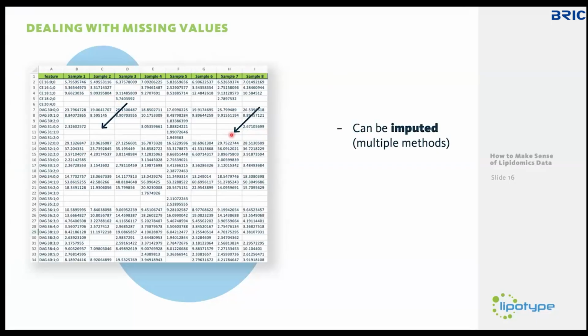One approach is that you can impute them. And there are multiple algorithms. We recently did a little paper testing most of the algorithms that came to our mind, and we found that one and two actually work very well for lipidomics analyses.